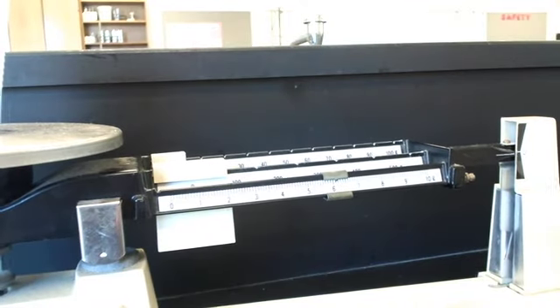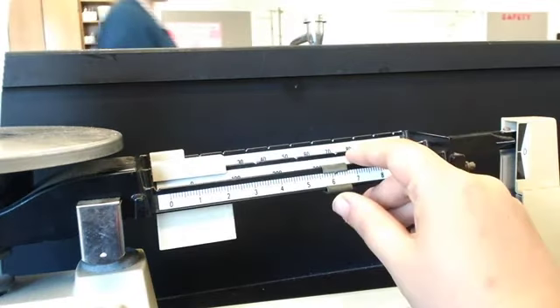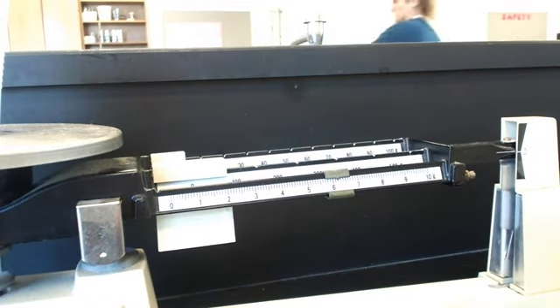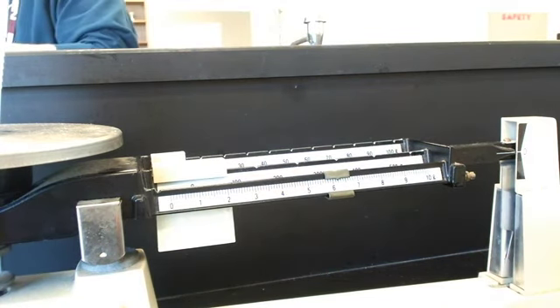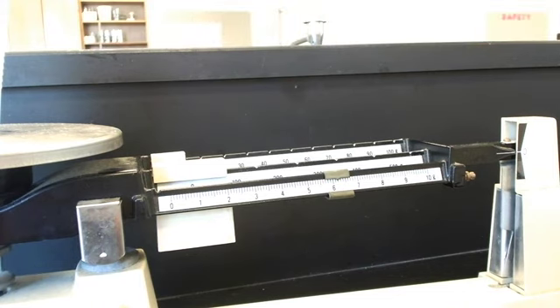So your format should be to the hundredth spot. Your estimates should be about to the hundredth spot. Okay, so that's your small beads. So I'm going to say that's 6.20.